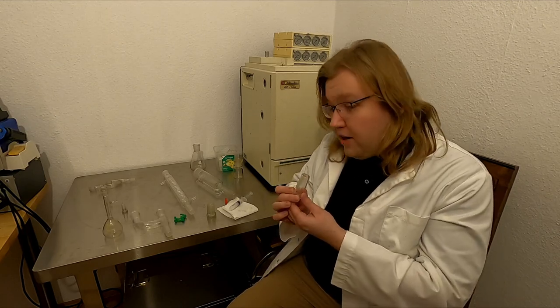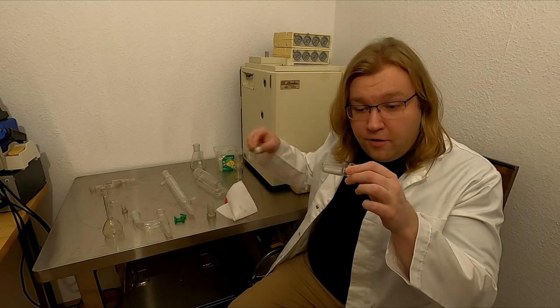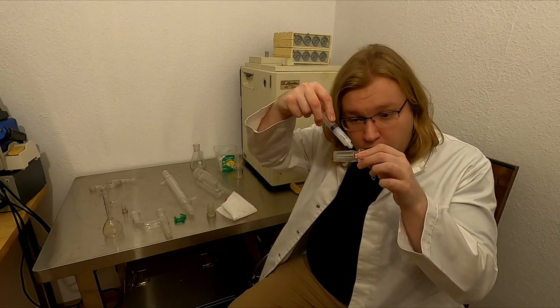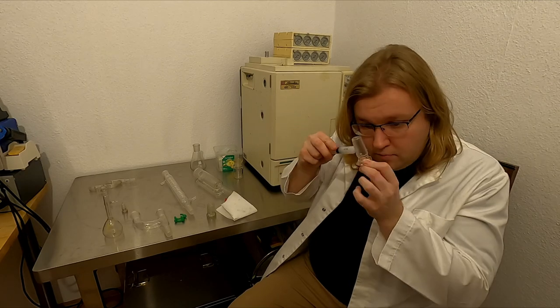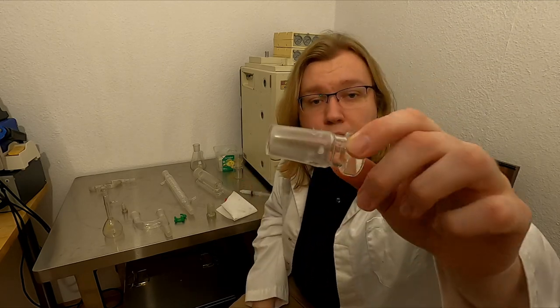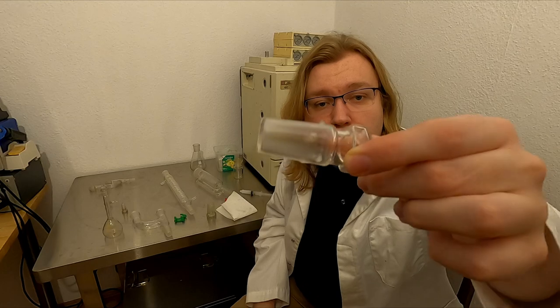To connect a joint, first start by applying a few dabs of joint grease along the top half of the joint. Do not use excessive amounts of grease, as this can end up in your reaction mixture.